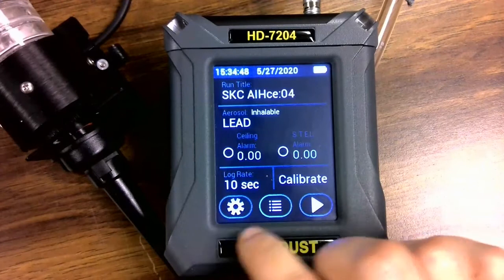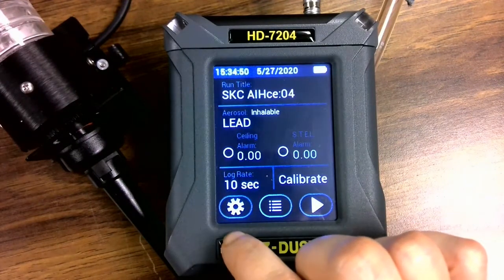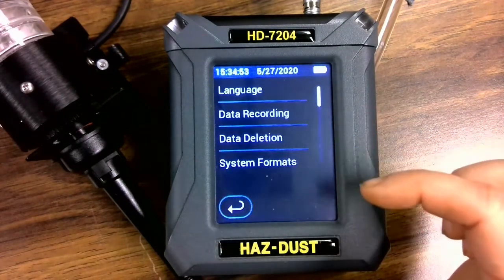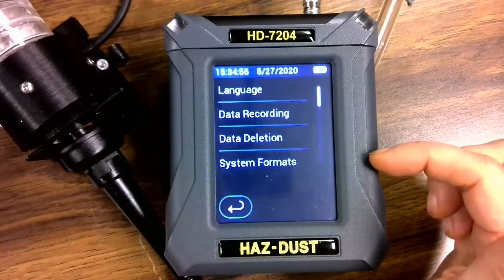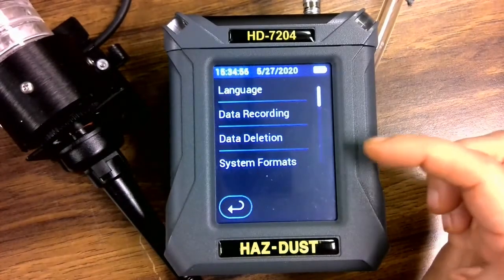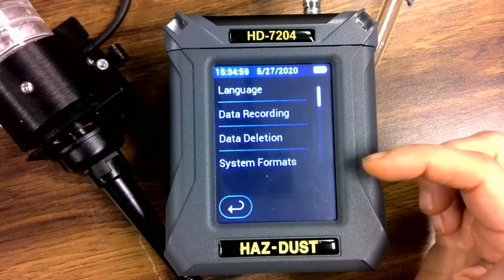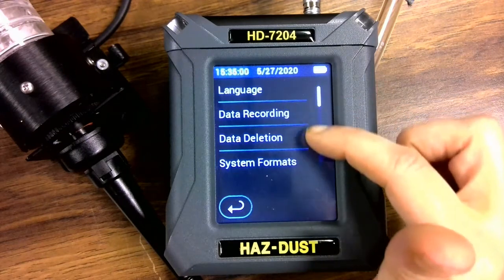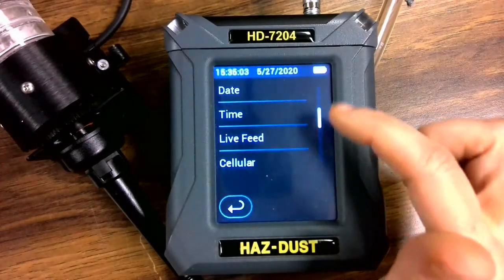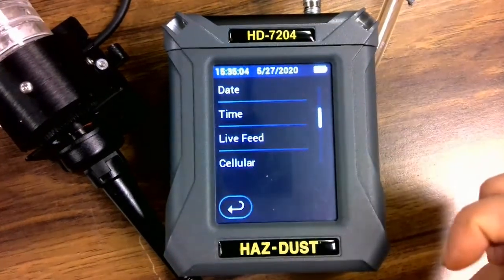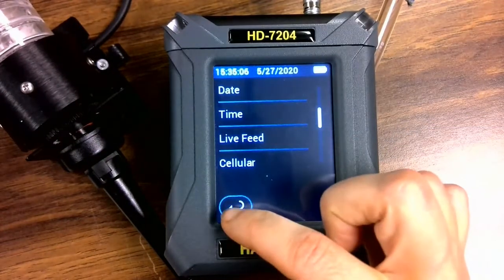Down here, we have three icons. We have the settings icon. In the settings icon, you can select a language, delete data, change the day and time format, set the day and time, and we also have the live feed and wireless options.